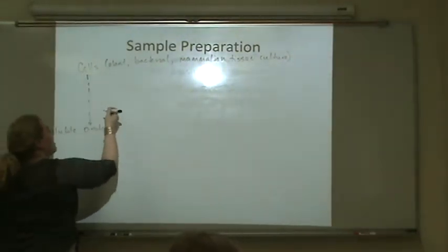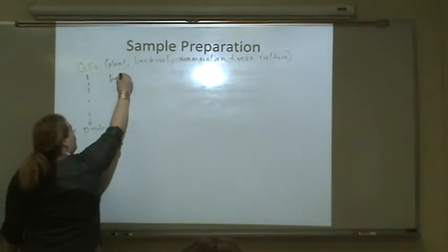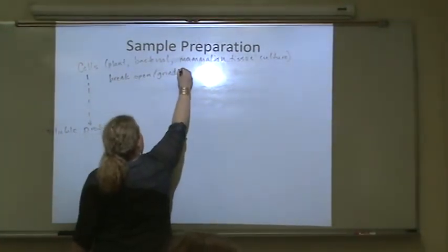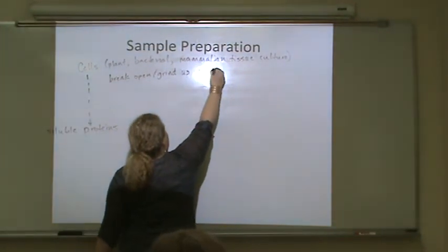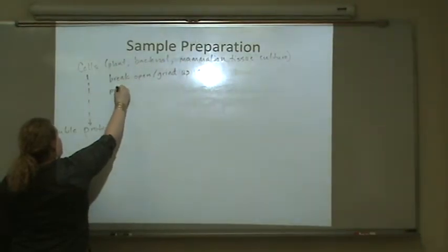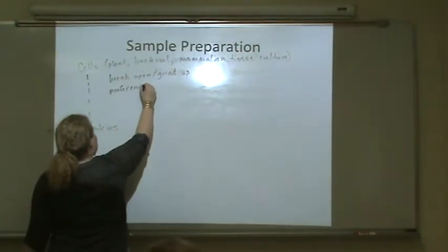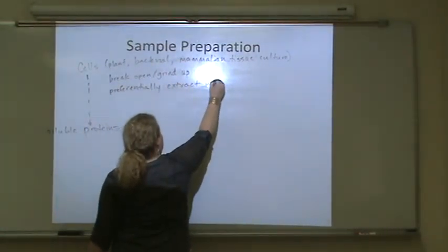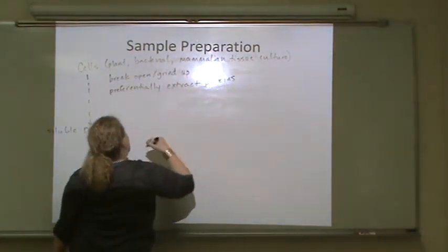So you will do something like break open, or if you're talking about plants, grind up the cells, do some techniques to preferentially extract proteins.